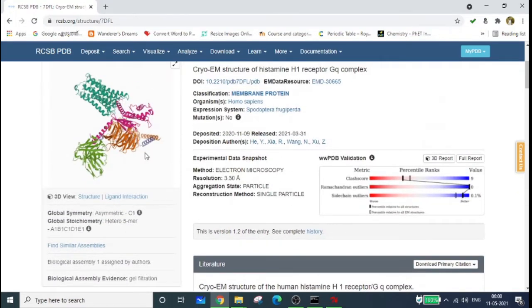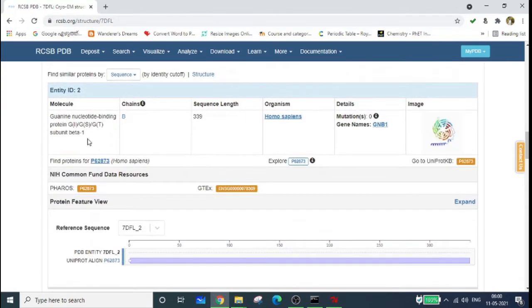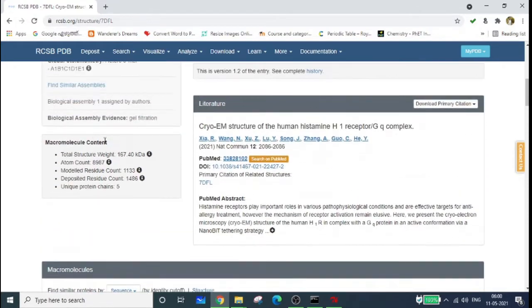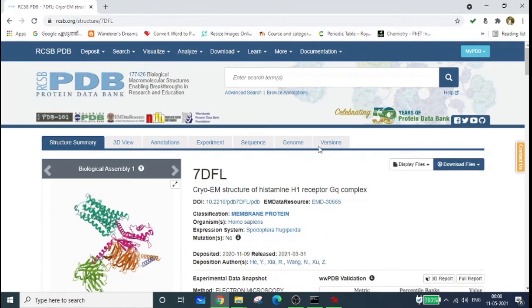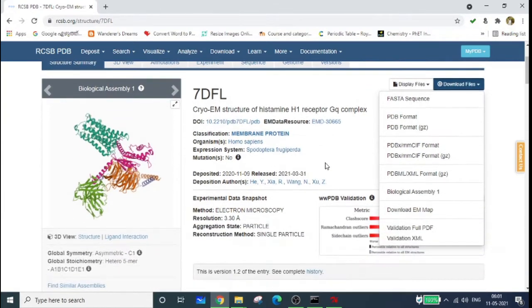If you want to know which molecules are present alongside this protein, you can see the list of macromolecules. It will also be useful to study the literature for more information about the molecule before docking. To download this molecule, go to 'Download Files' and select the PDB format, since for AutoDock we need the PDB format. Click PDB format to download.